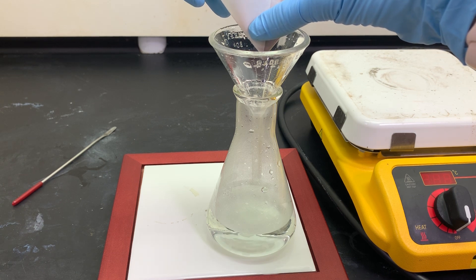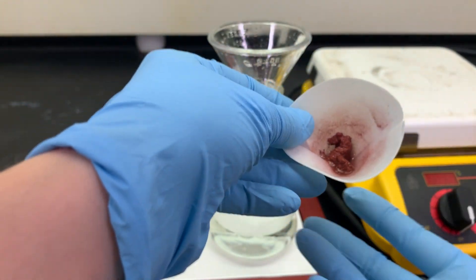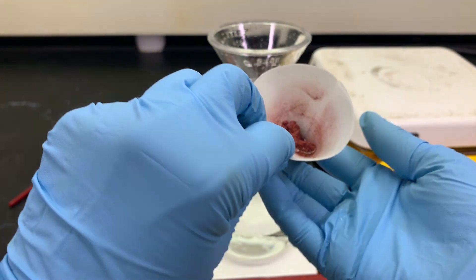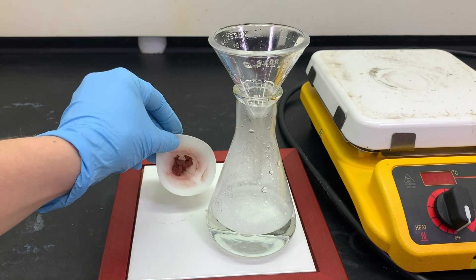All we should have left in that filter paper is our solid copper metal product. Take a look at that copper. Because that filter paper is still wet, we are going to allow it to dry overnight before we record its mass.